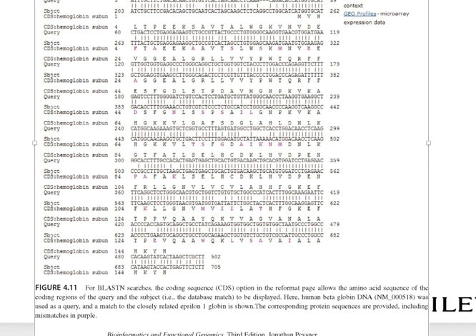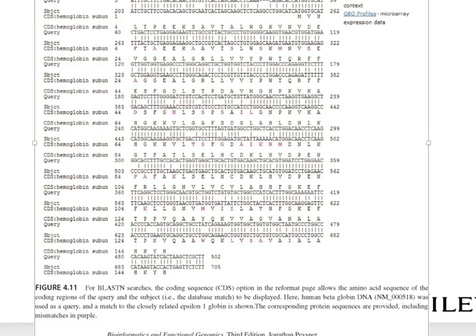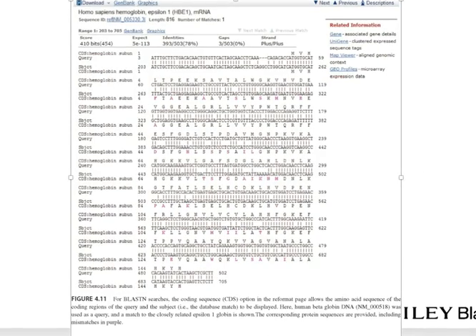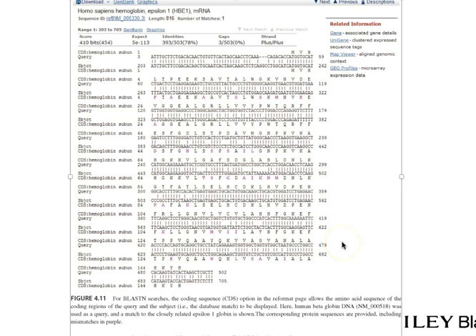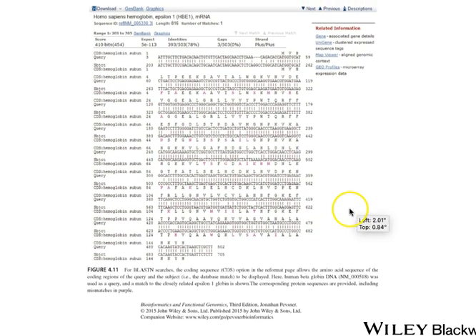For the purposes of this presentation, if I make this bigger or smaller, it looks like they cut off some of the text inside this. Here the human beta globin was used as a query to match against the closely related epsilon. So you use one human to find the epsilon. And this is how you get a feel for when things are working well for you when you're doing these sort of analyses, if that makes sense.